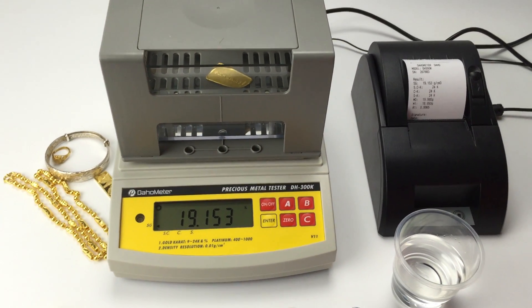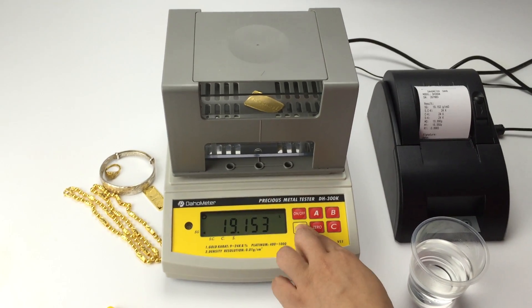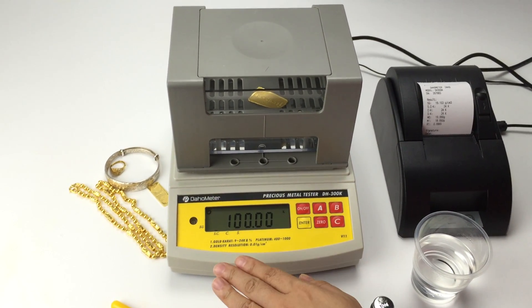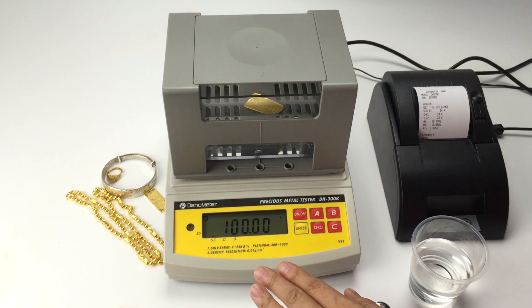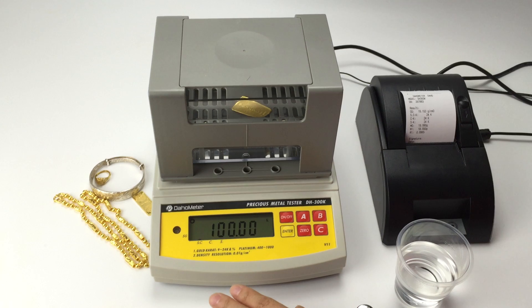Then let's press ENTER. 100. This is the purity percentage for gold, silver, copper.